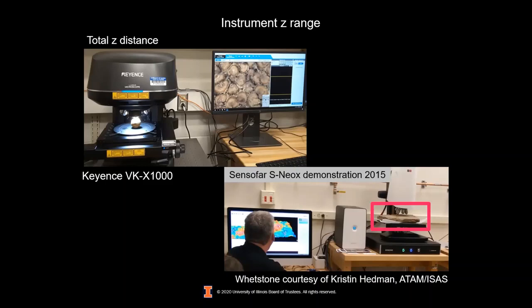There is sometimes a little bit of extra mass, if it's really, really heavy, that affects stitching. But if you're just looking in one particular image and not moving the sample from place to place, then that part isn't a problem either. Also on our Keyence, the limit weight that the stage can take is about 6 pounds. So anything more than 6 pounds, and we had samples that were more than 6 pounds, we need to adopt a different way to measure them.